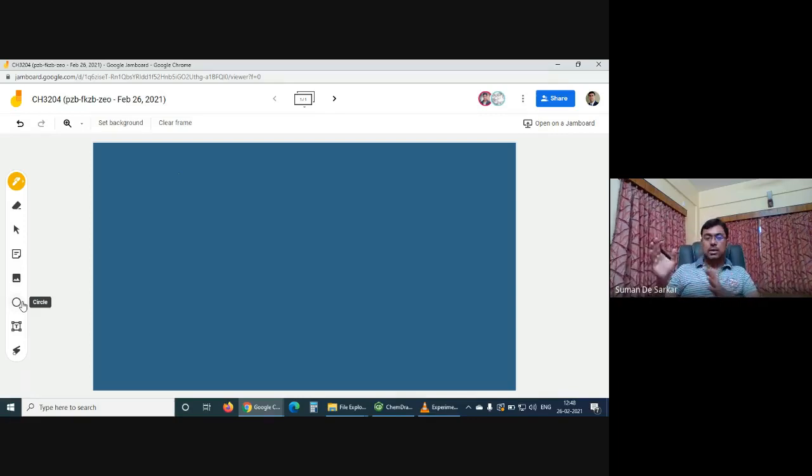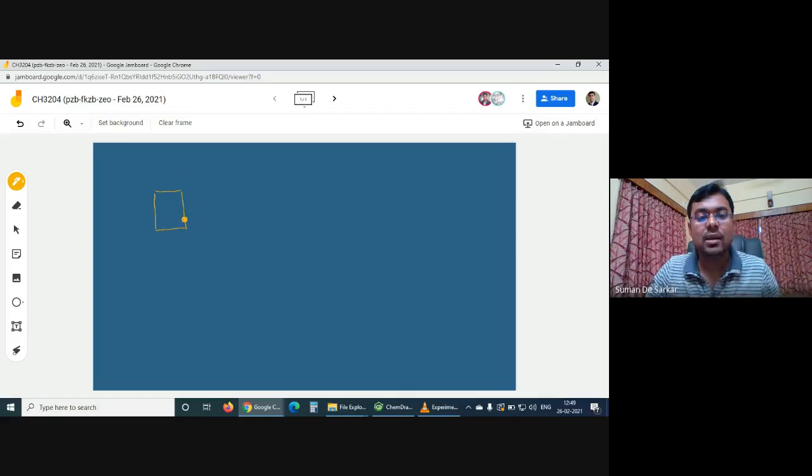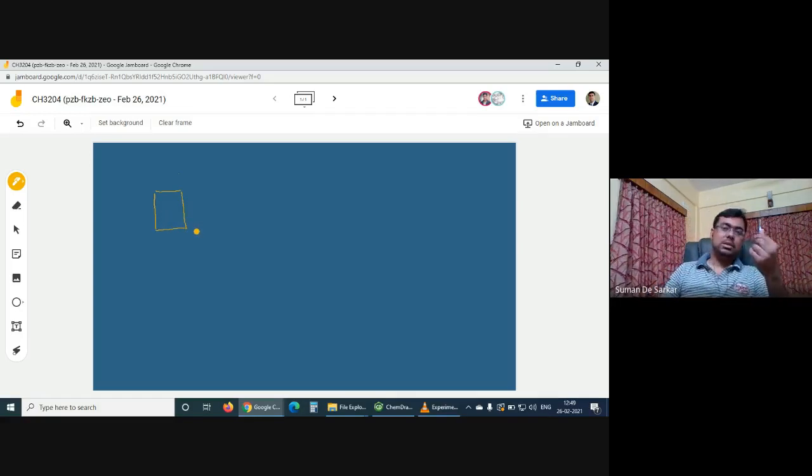Okay, so let us go back to this TLC thing. In TLC, it's just a TLC plate needed, as I already showed in that video. It's a very thin layer. Normally there is an aluminum sheet there. Probably you have seen aluminum wraps, but this is a little bit thicker than that.